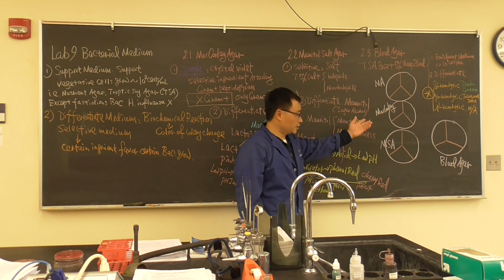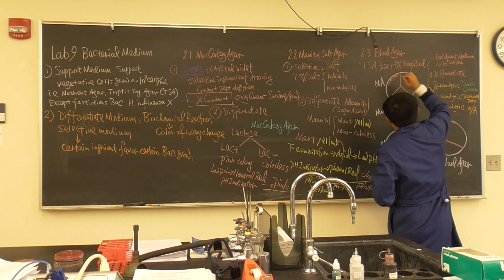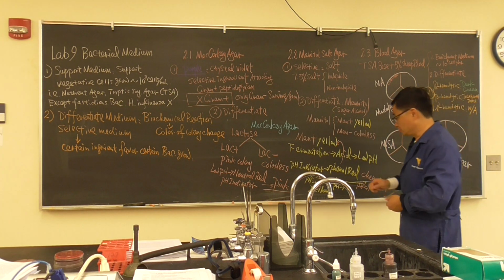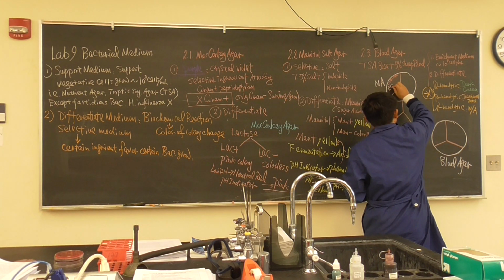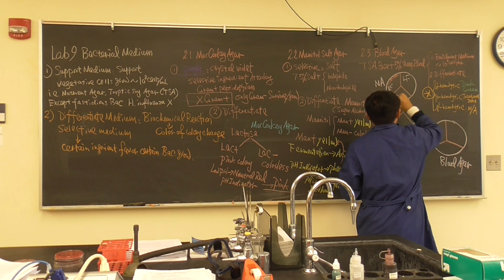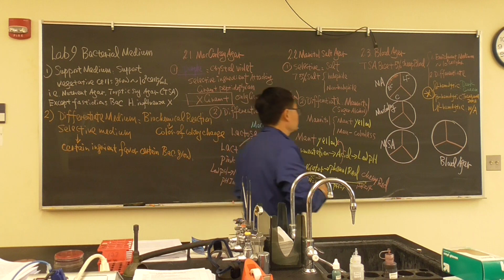Of course, you need to label your basic information: your initial, bench number, date. But more important, what are the bacteria we're going to add in? It's different. We will add three different media. We will do E. coli, Lactobacillus fermentum, and Citrobacter. Let me double check the Citrobacter. You write CF there. Okay, Citrobacter.